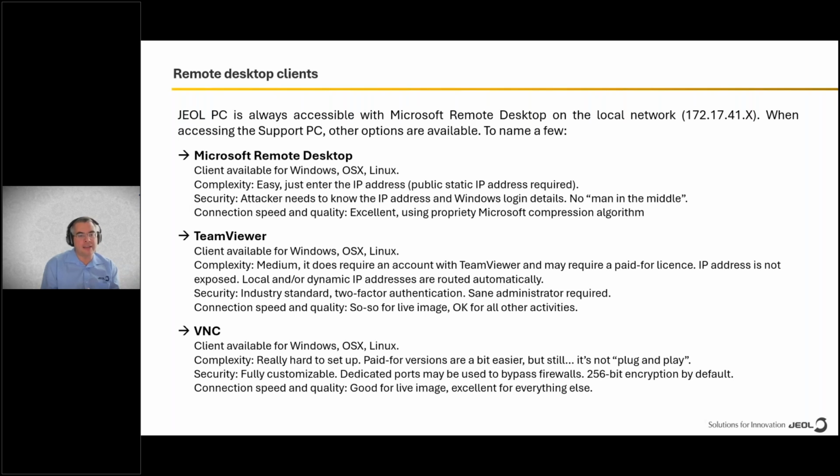It also has clients available for the three major platforms, Windows, OS X, and Linux. It also has a client available for Android and another one available for iOS. So in principle, you could use your mobile phone to control the support PC remotely.